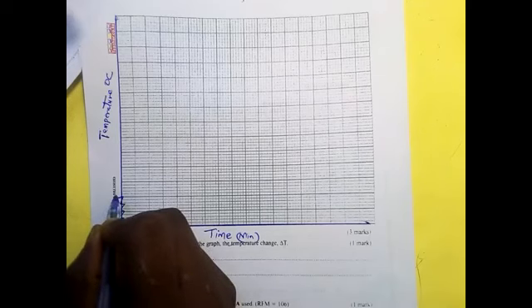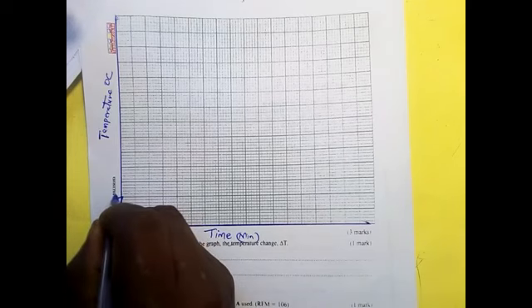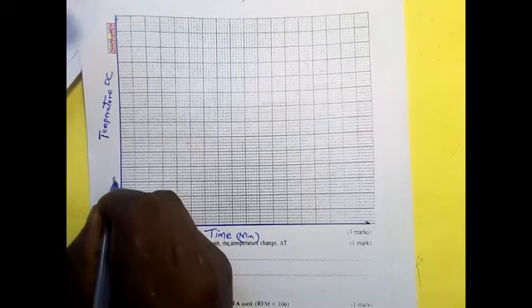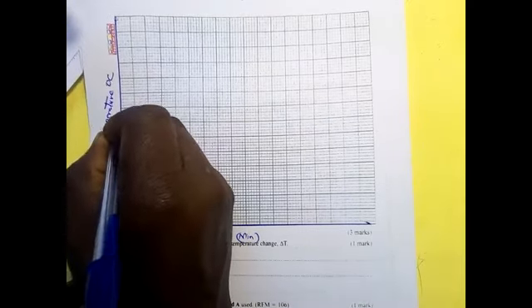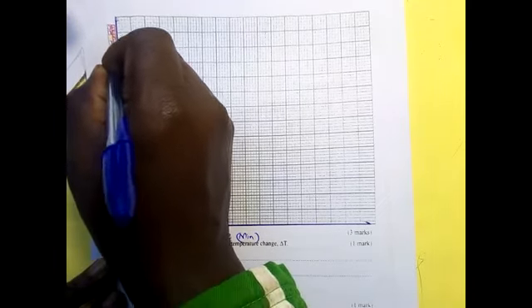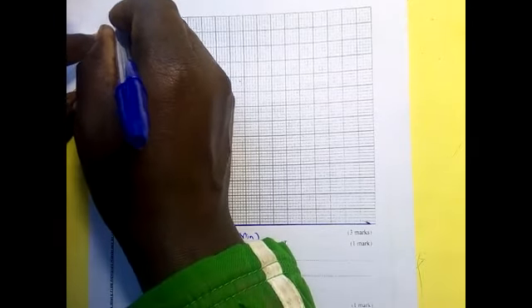Remember our range is 24 to 32, therefore we can start here at 23, and then 24, 25, 26, 27, 28, 29, 30, 31, 32, 33, 34, and 35.